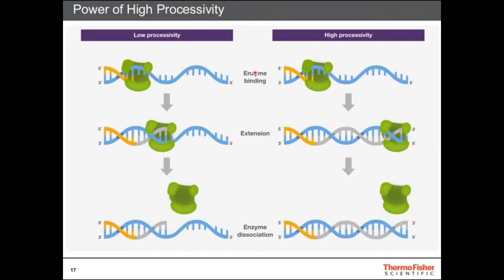As we stated earlier, when you have a low processivity enzyme, such as a true proofreader, because it's constantly having to go in the 3' to 5' direction to check for any potential errors, it slows the overall synthesis down, so you don't get a lot of product on your gel due to this impact on processivity. Typically, a high processivity enzyme will speed through and synthesize a lot of DNA, resulting in very, very nice fat bands on your gel because of a lot of PCR product.